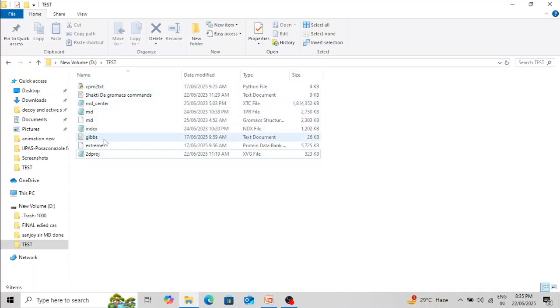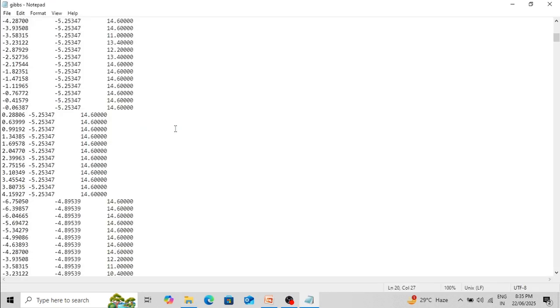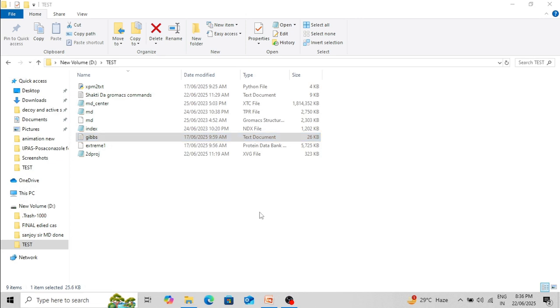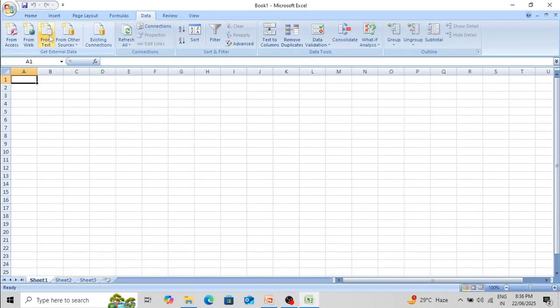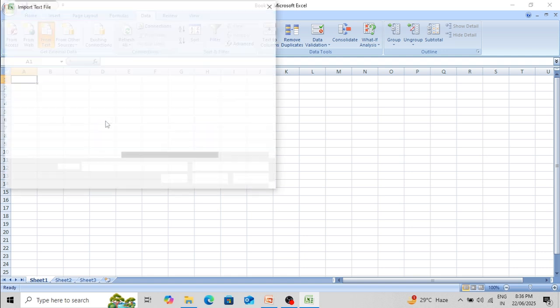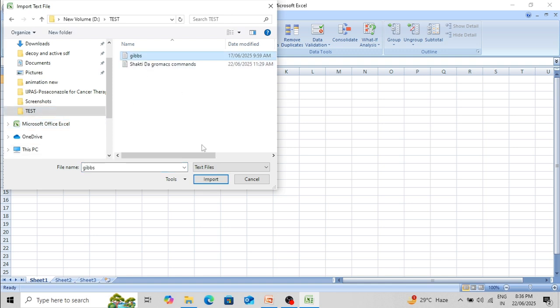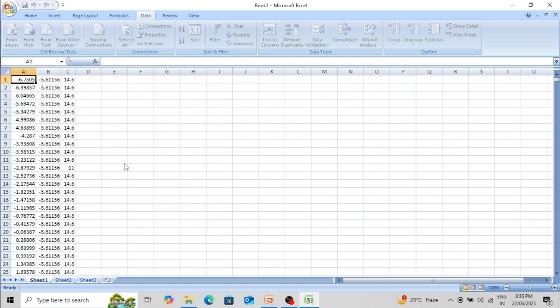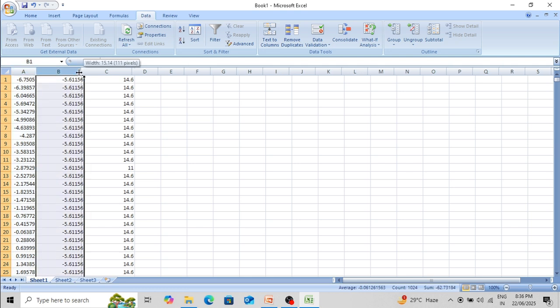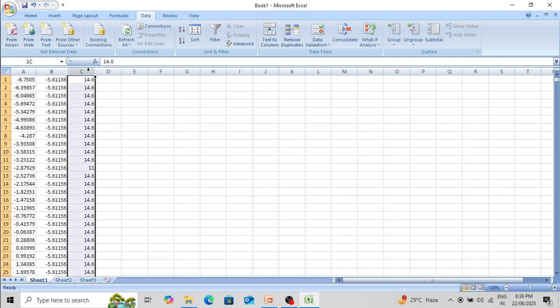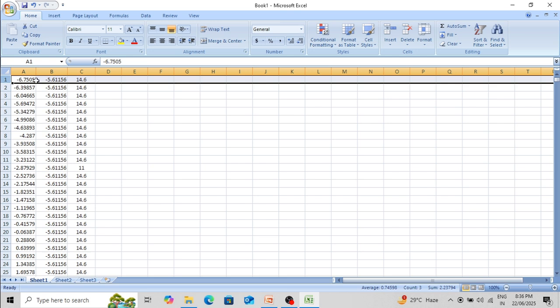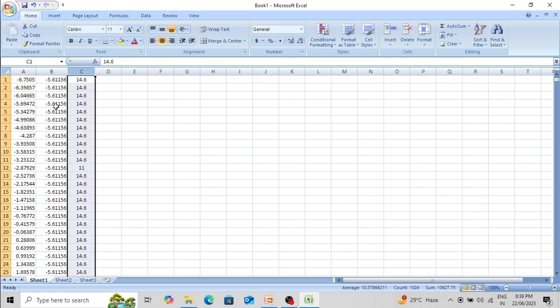In this folder you can see the gibs.txt file — it is present in text format. Let's open it in Microsoft Office Excel. Open Excel, then go to Data > From Text and select the gibs.txt file. You can see the first principal component, second principal component, and the free energy values. Now we want to see the conformation with the lowest free energy.